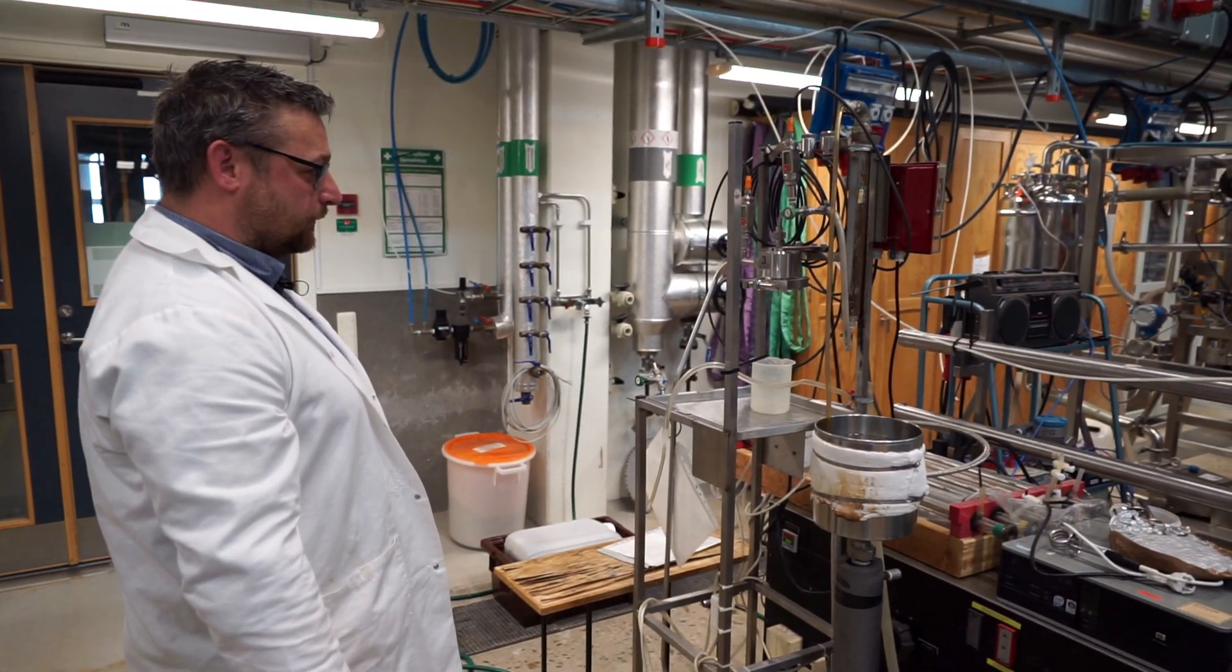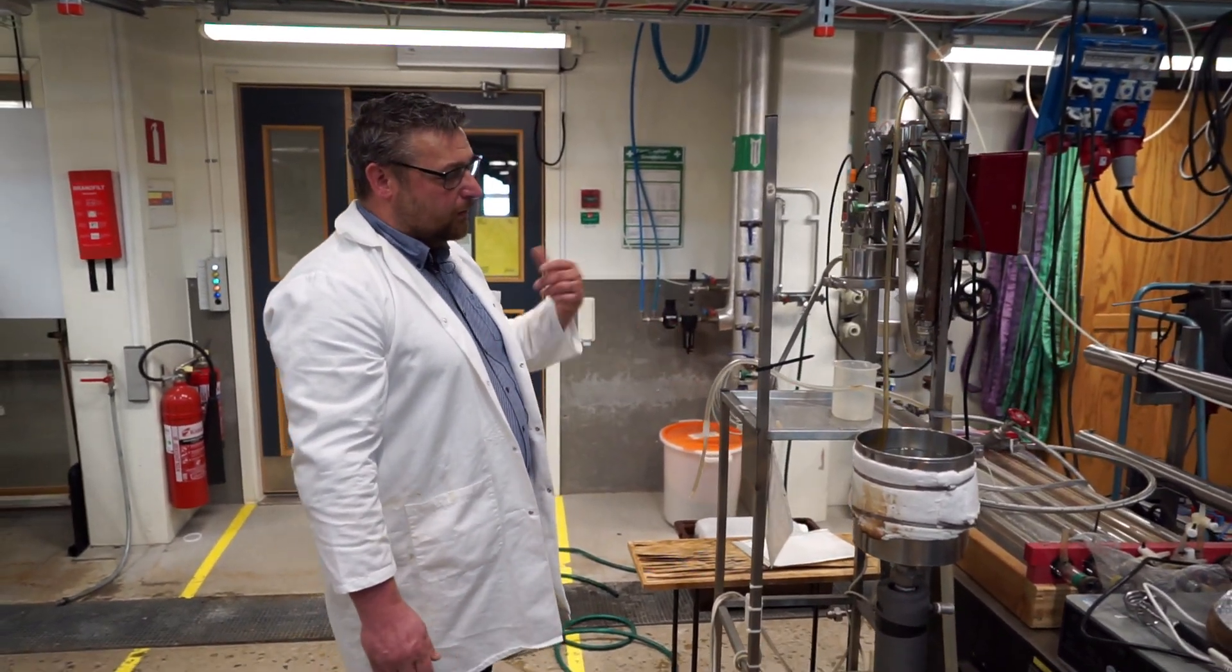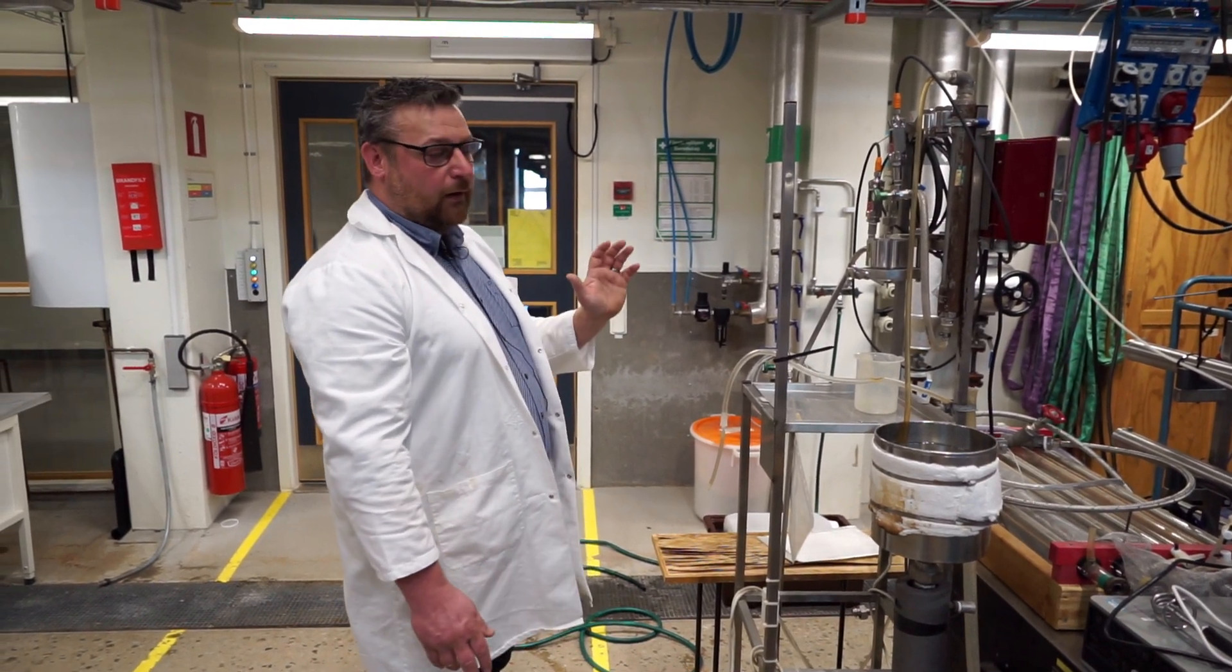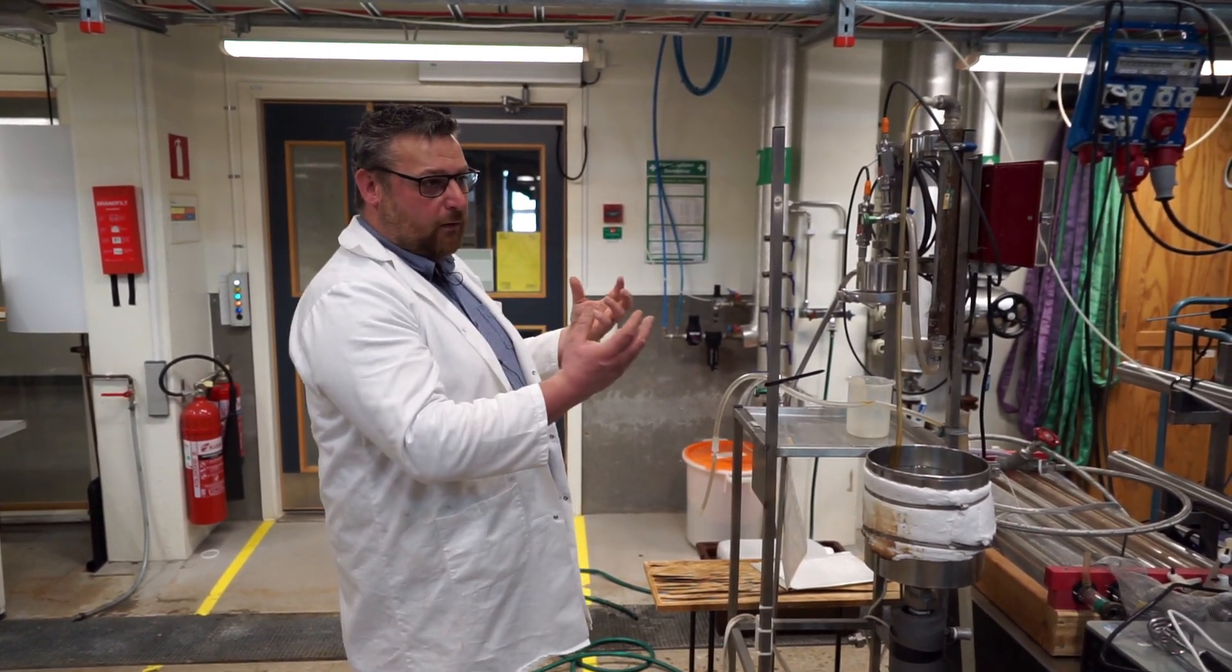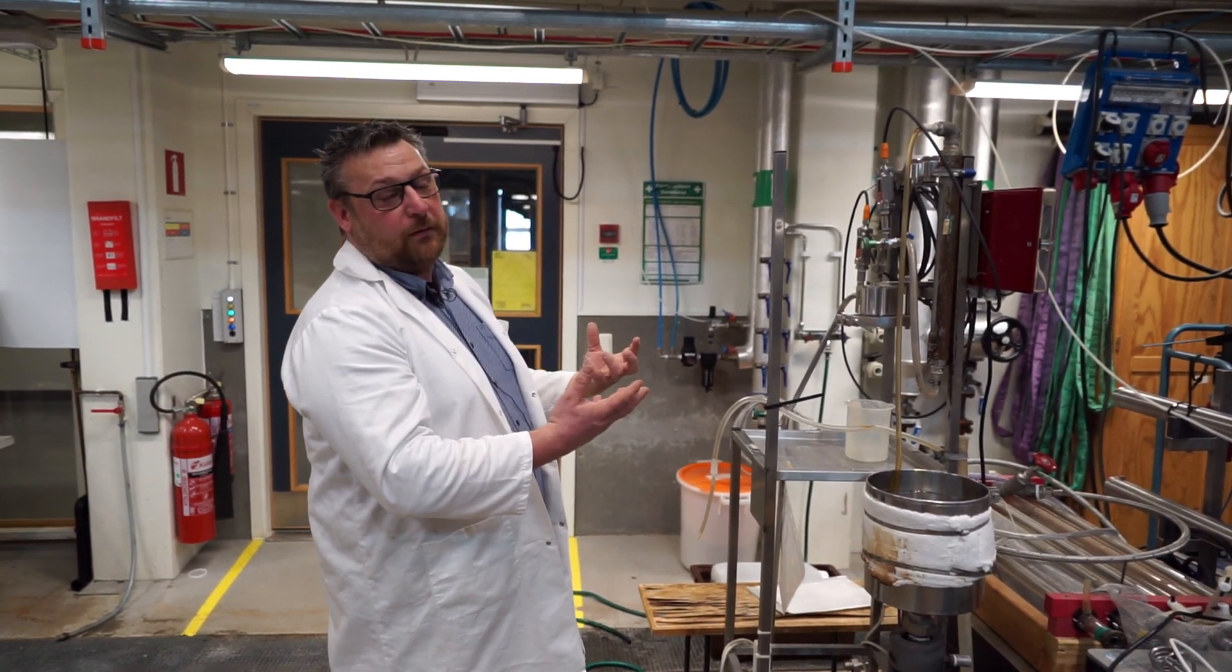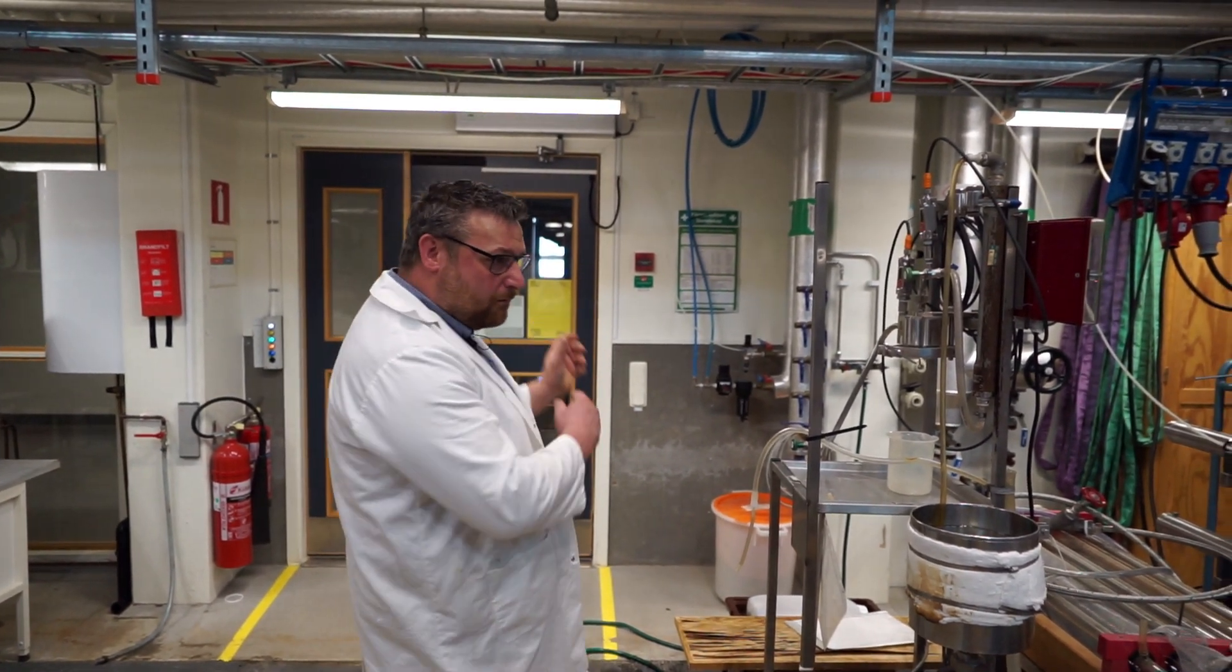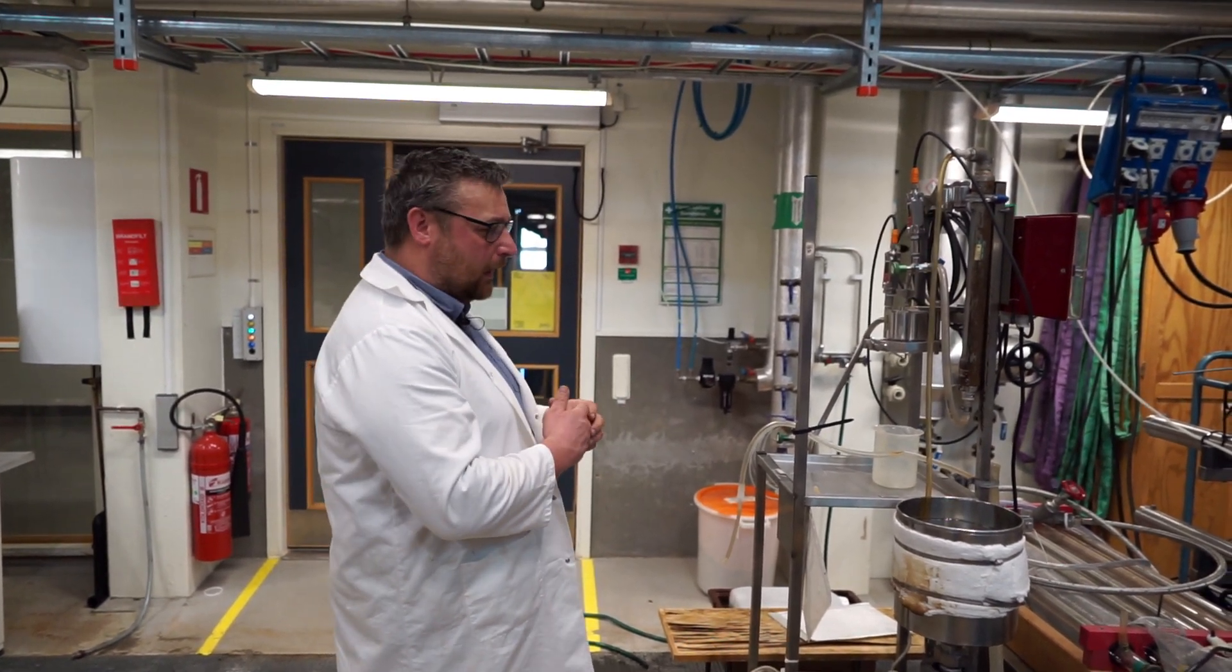And the cross flow, why is that important? The cross flow is important when you have a real solution because the cross flow will be a velocity along the membrane. And a higher velocity will reduce the boundary layer and a thinner boundary layer will lead to a better mass transfer, more or less. Okay. So we have friction forces removing... Yes. At the highest speed, we are basically removing things that has accumulated at the membrane surface at a larger rate.